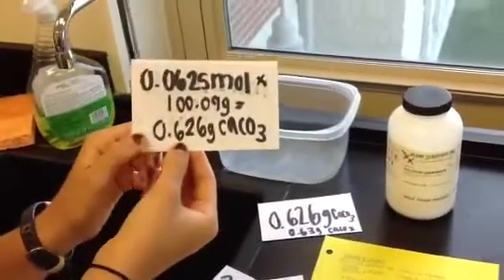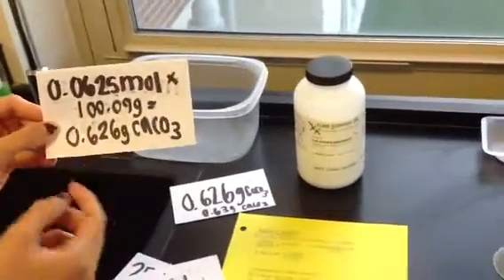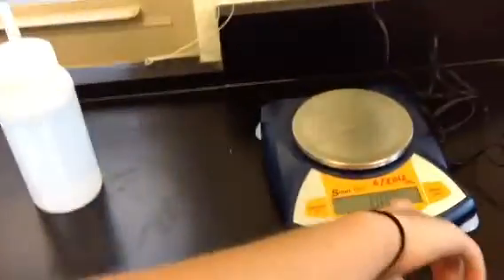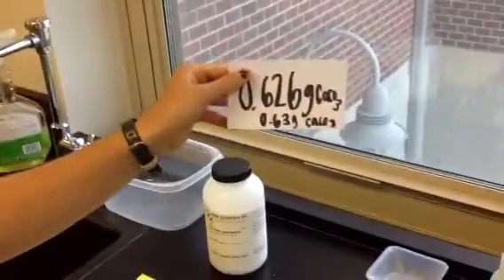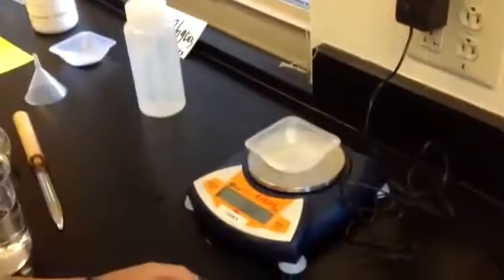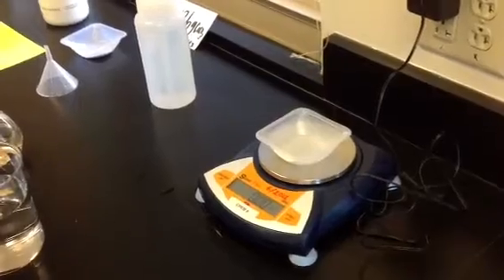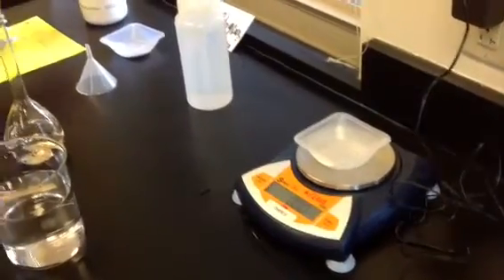So I get 0.626 grams of calcium carbonate, using three sig figs because that's the smallest number in my equation. But my scale only has a precision of two significant figures, so I rounded it to 0.63 grams of calcium carbonate, which I pre-measured. If you were to measure this yourself, you would put the weigh boat on first, then zero the scale in order to get an accurate measurement for your solute.